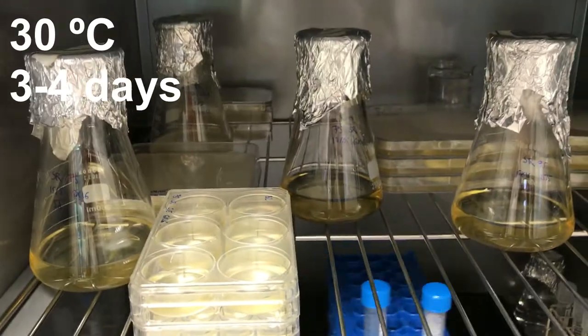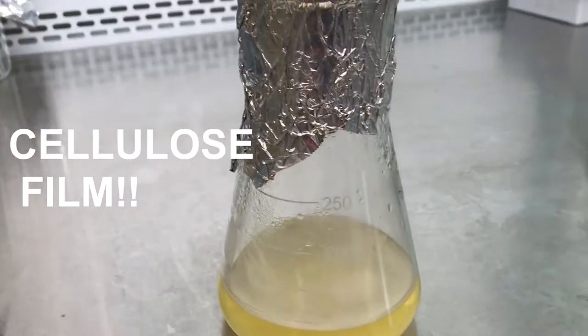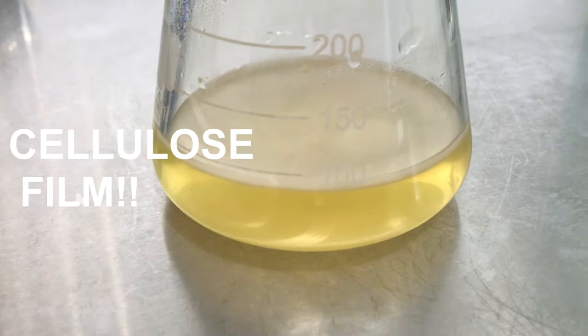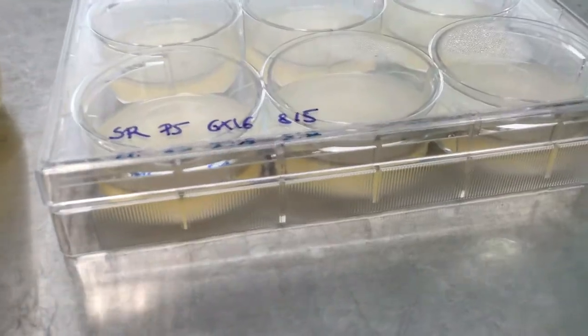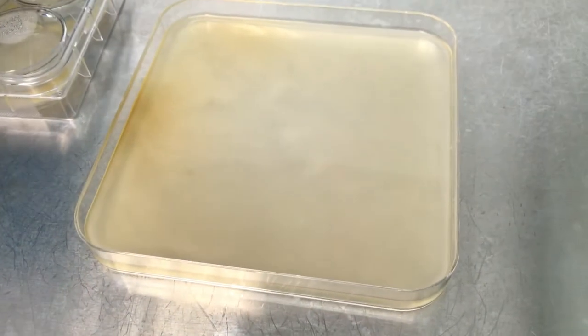And ta-da! We obtain a cellulose film on the interface liquid-air. Depending on the flask used, the cellulose can have different shapes, circle or square.